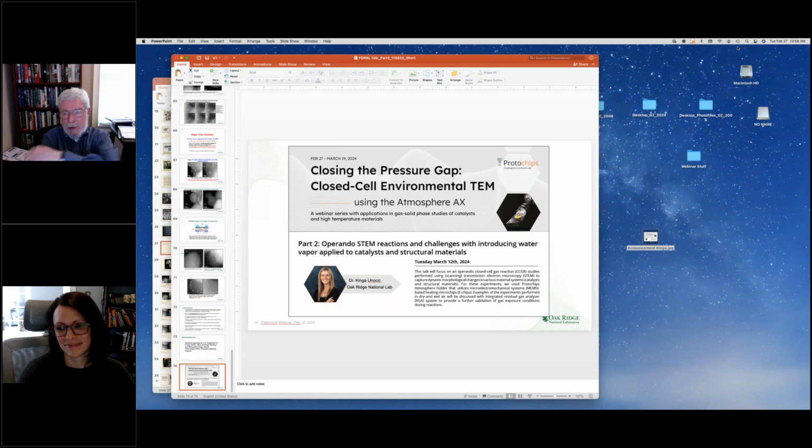And so we're proposing a significant program to do fundamental studies of how you do experiments that are electrothermal in nature, because our work is now on EV alloys, using aluminum for electric vehicle applications, in particular to replace copper as a conductor. So a xenon plasma FIB to make samples and do fundamental studies of how you can. We don't know how to do electrical measurements. We don't know how to mount samples and what's important.